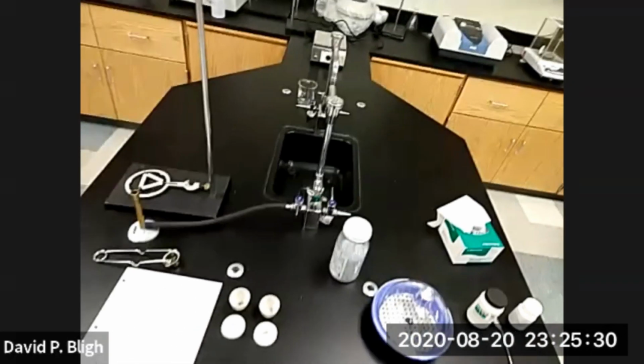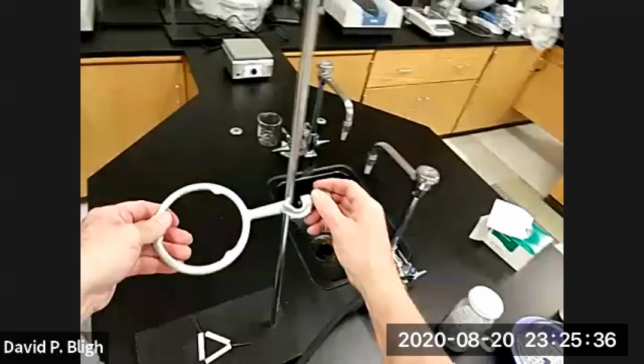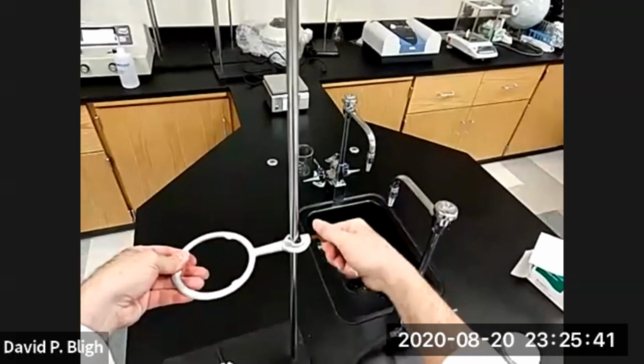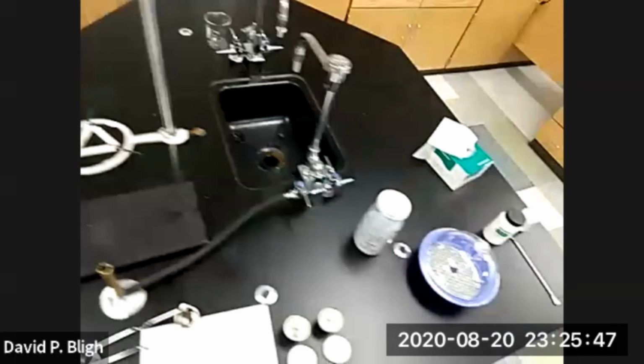Okay, we're going to need some things. We're going to need a ring stand. We're going to need a ring. And that holds our little clay triangle, like that. Now, why do we need a clay triangle?